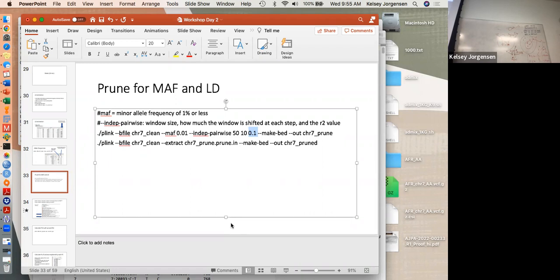So use this to cut it, and then what was the output? That's okay, you almost got there. Maybe just get the clean files from Google Drive and go from there. I do have the clean ones. Oh, perfect. Yeah, just move those into the same folder.